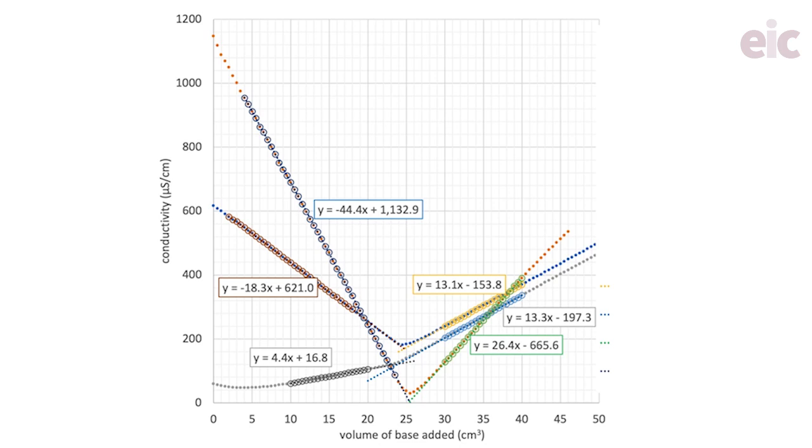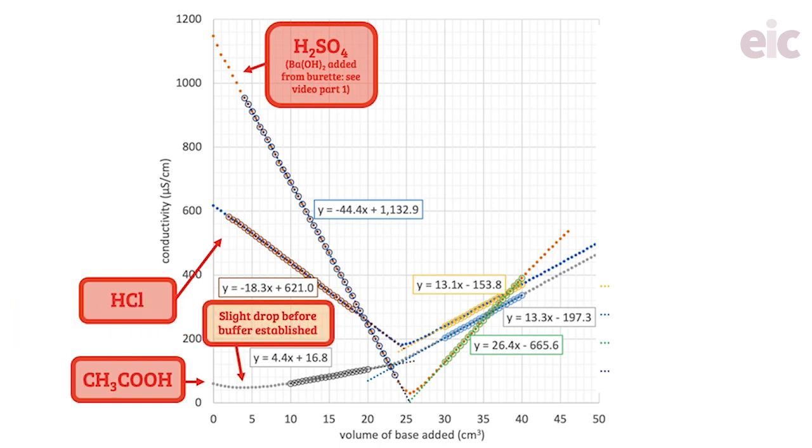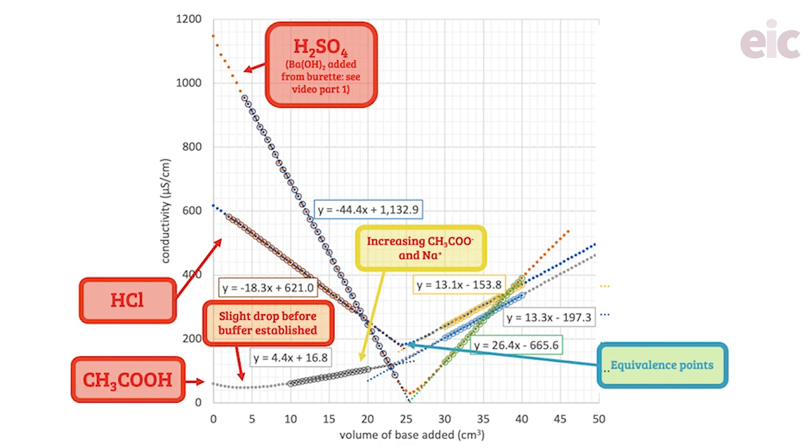Okay, it makes for an easier cleanup, and I also benefit from minimizing ion-ion effects that cause conductivity to change in a non-linear fashion as you go to higher concentrations. Notice the way that the sulfuric acid is almost twice the conductivity of the monoprotic HCl, which is in turn 10 times more conductive than the weak acid. This is from a rough titration at home over the holidays with bench solutions using cheap jewelry balances, thanks Bob Worley, for gravimetric dilutions, and I still had beautiful trend lines crossing within a couple of microsiemens per centimeter of the conductivity of my deionized water alone, and really close to the halfway point of the burette.